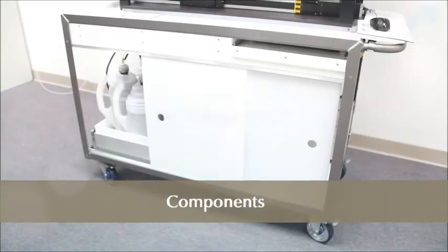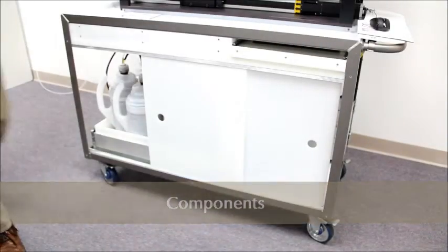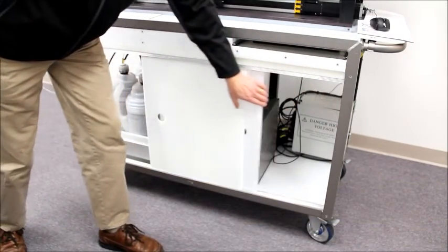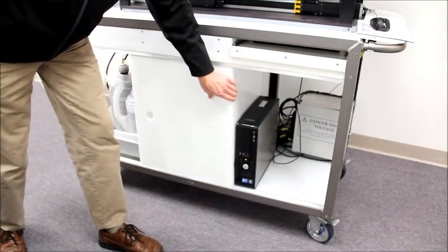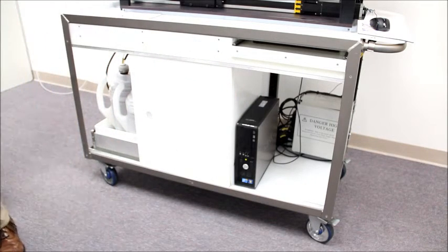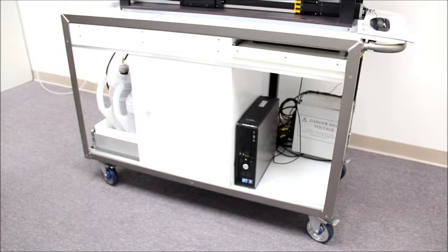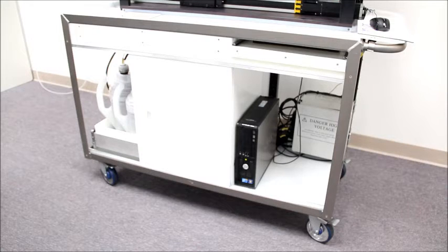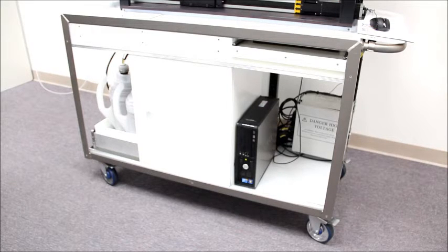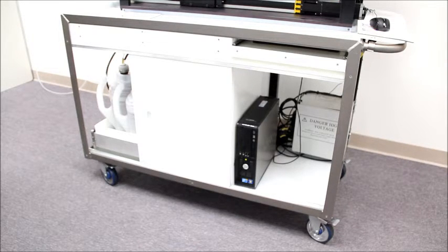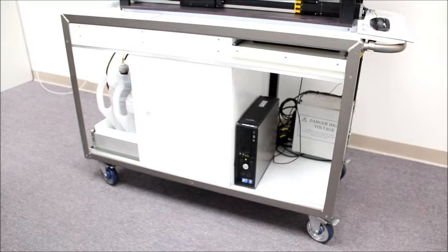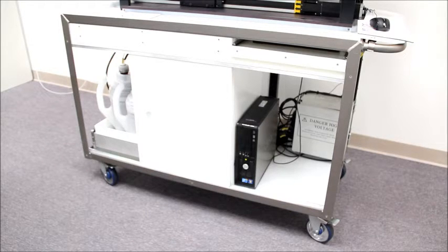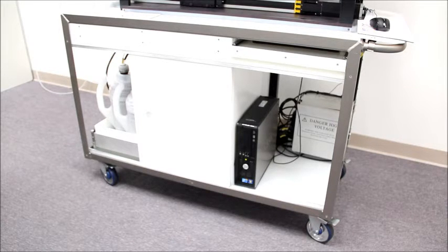On the lower shelf of the instrument is the computer and the power supply, which supplies power to the entire instrument, including the computer. The power supply can be plugged into a wall outlet. It will automatically detect whether it is drawing power from a 110 or a 220 volt circuit and adjust itself accordingly.